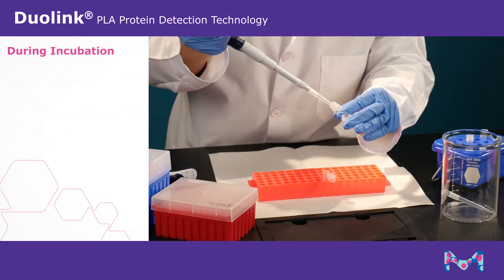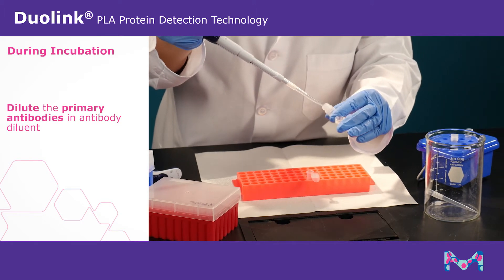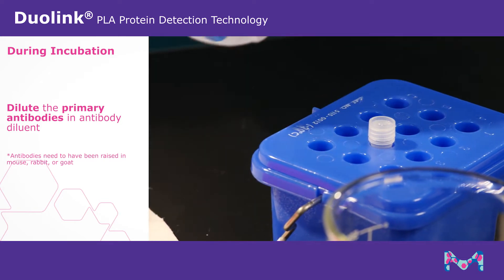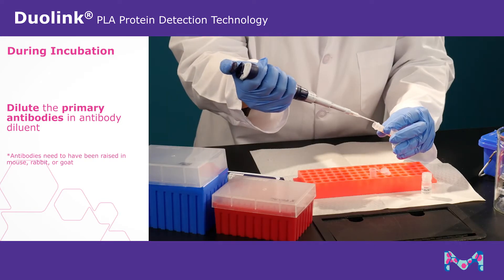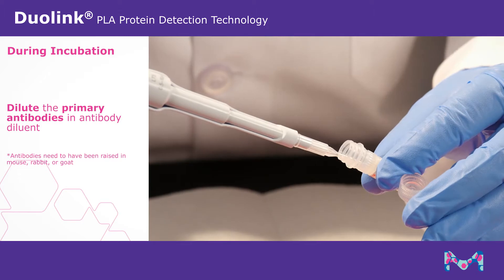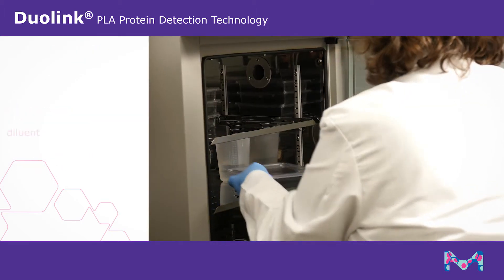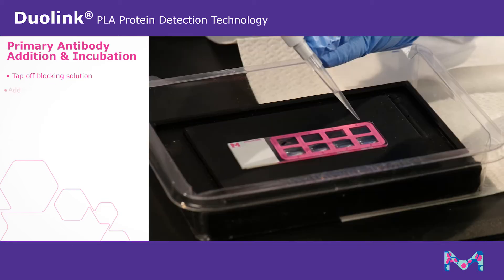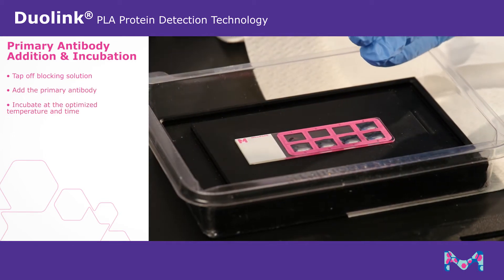During the one hour incubation, dilute the primary antibodies in antibody diluent. Primary antibodies need to have been raised in either mouse, rabbit, or goat in order to be recognized by the Duolink PLA probes. After incubation is complete, tap off blocking solution and add the primary antibody, then incubate at the optimized temperature and time.